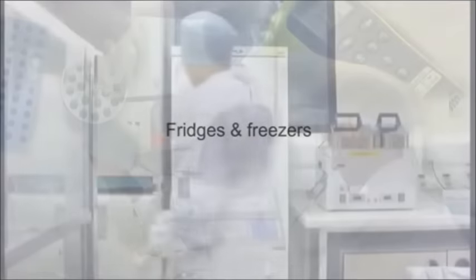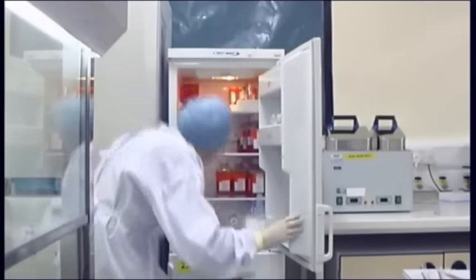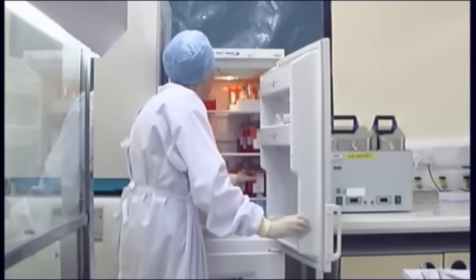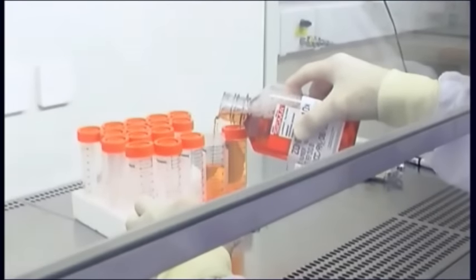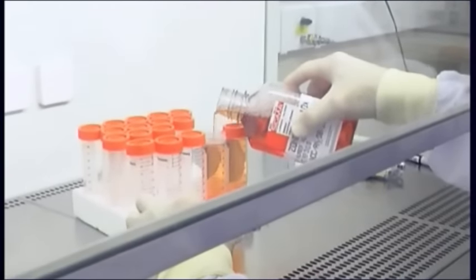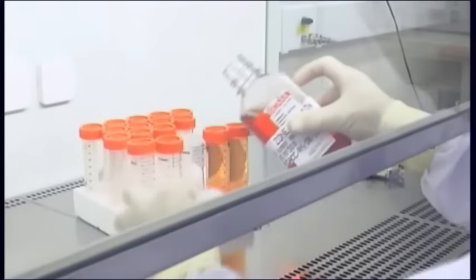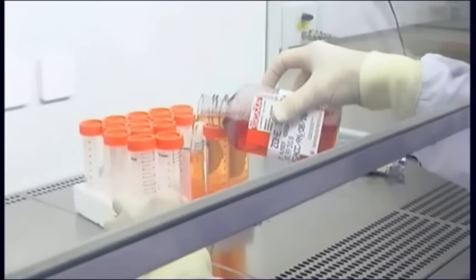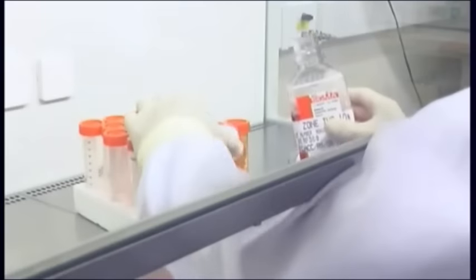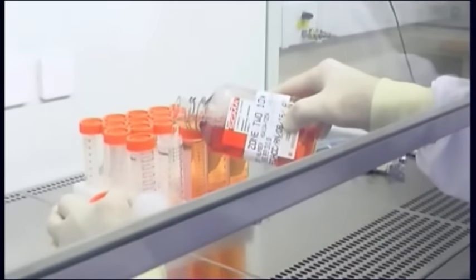Fridges and freezers: Most cell culture reagents require storage in a fridge or freezer. Always check labels and literature provided by suppliers. To avoid repeated heating and cooling of reagents, aliquot reagents into suitable volumes and concentrations. Always label these containers appropriately. It should be noted that pouring from container to container is not normally considered good practice, but in the case of the aliquoting of entire bottles of media or reagents, pouring is acceptable.